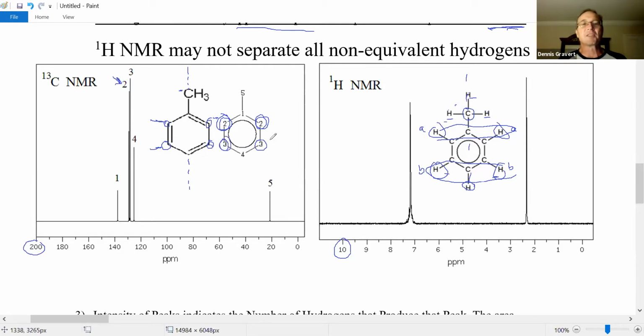We got carbons labeled 3 here. There's 2 carbons overlapping to make 1 big peak. Yeah, that's this one here. It's also a lot larger, more intense than the others. But in carbon NMR, it wasn't exactly proportional, right? There's one carbon producing this peak, and this carbon is just producing this peak, and that's kind of nice. These two are the same height. This looks proportional. Peak 4, wait, 4 is this carbon.